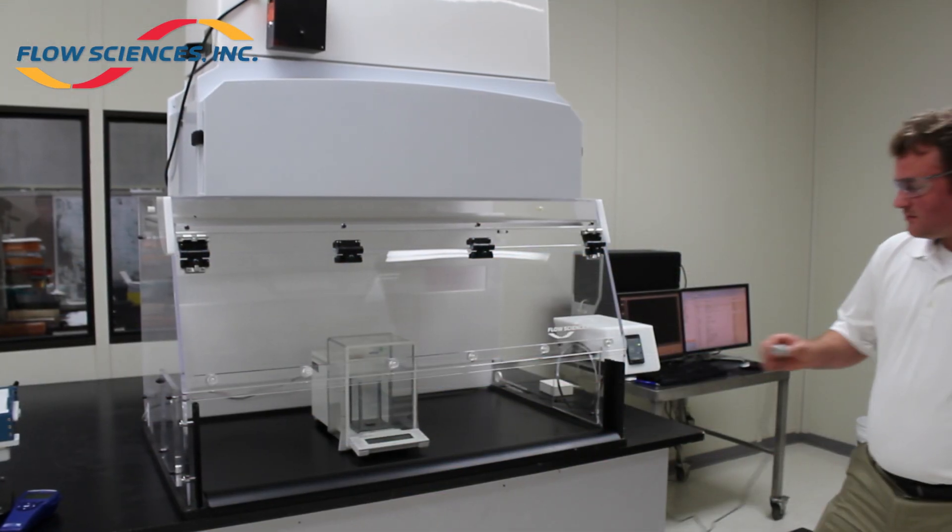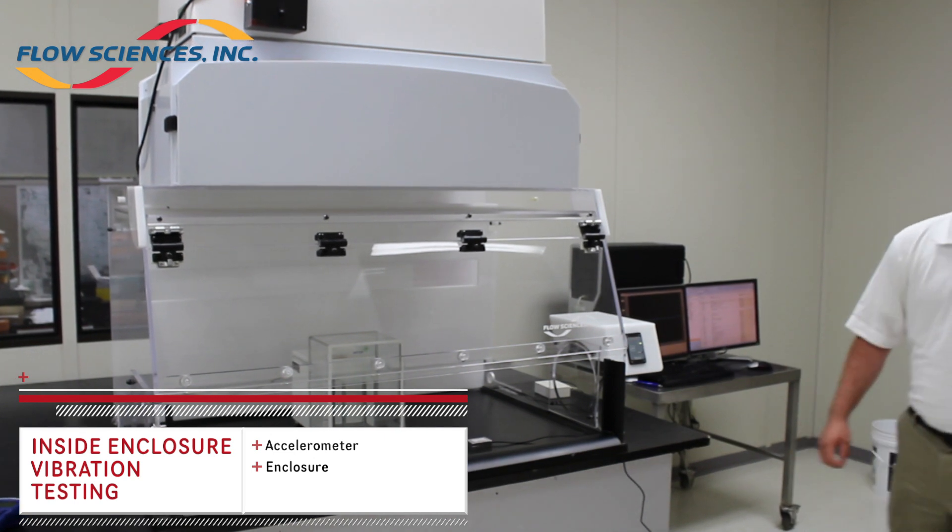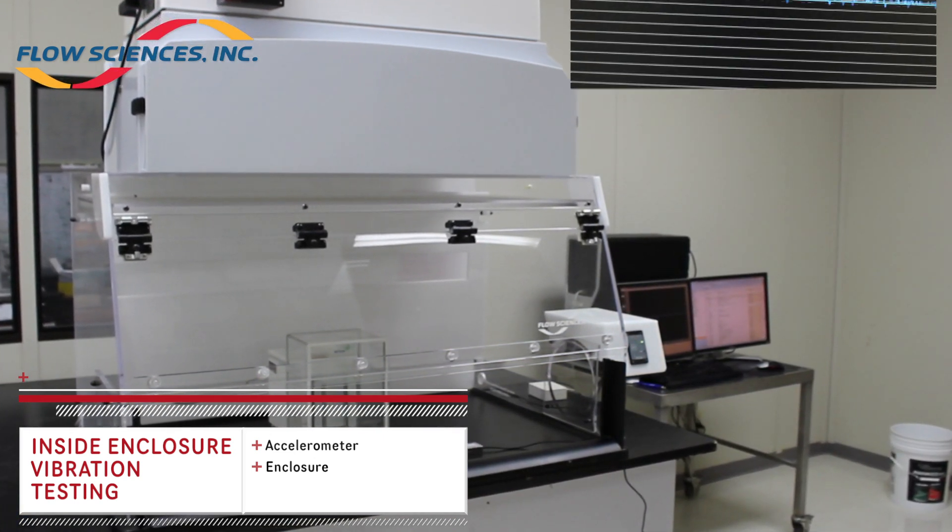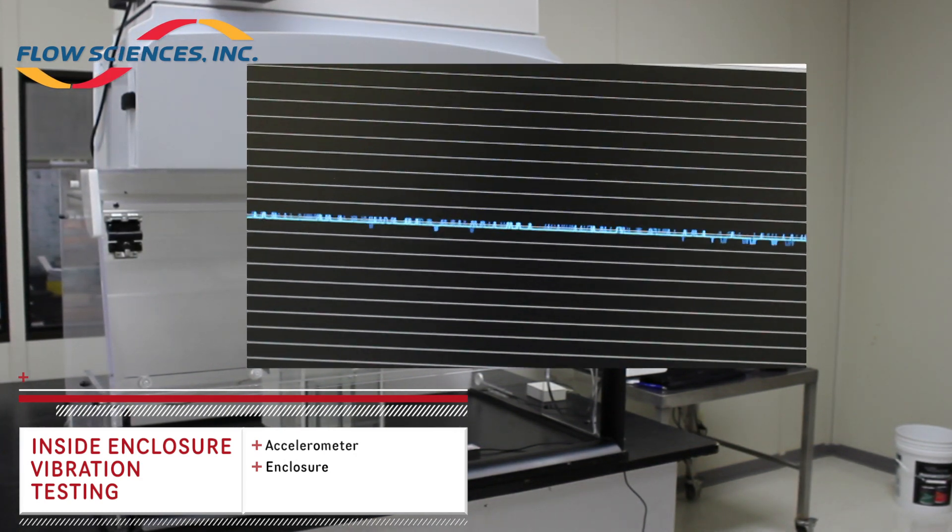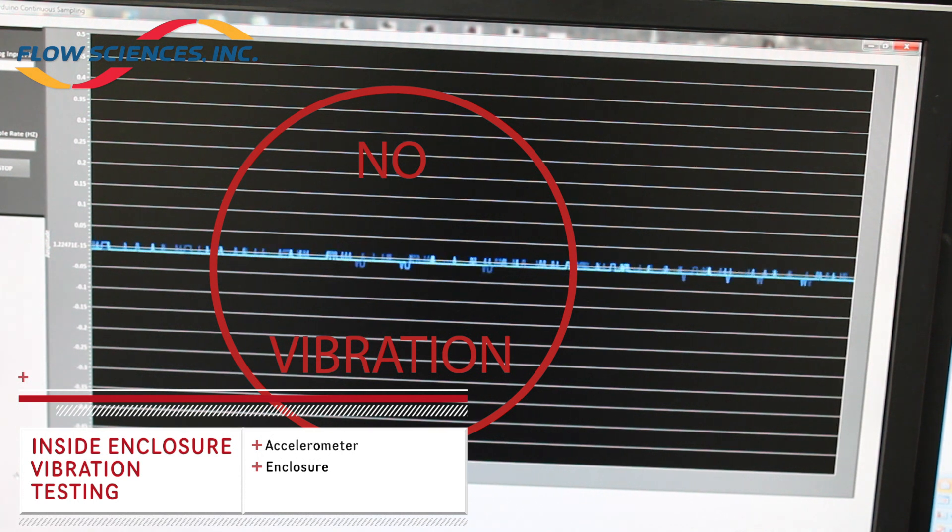Test 5: The fan still operating at a standard velocity. The sensor was placed inside the enclosure centered on the phenolic work surface. This was to determine what vibrations travel through the enclosure from the fan unit directly onto the work surface.